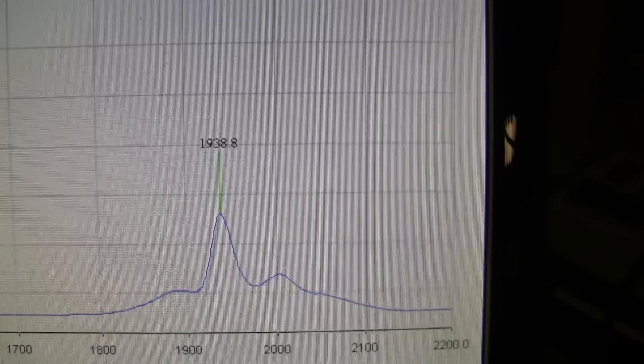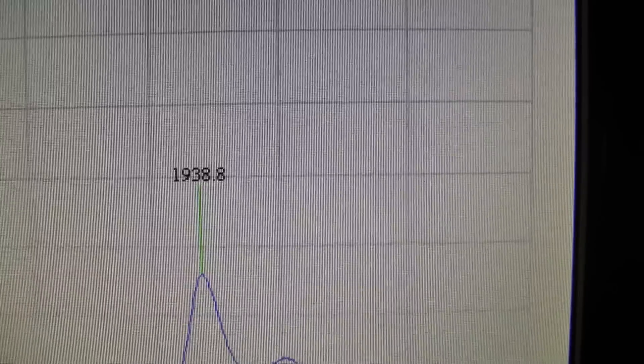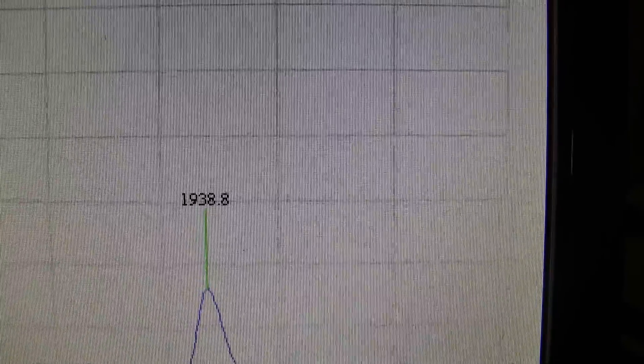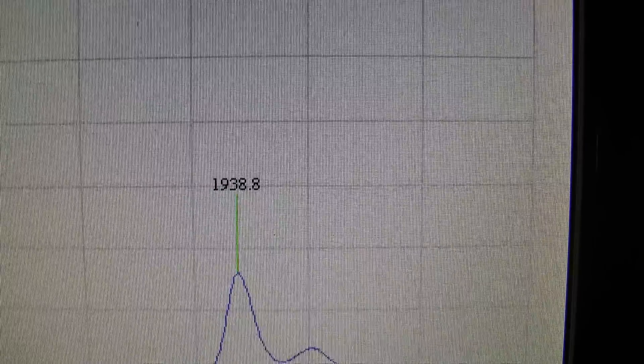And going back to our Near-IR peak. That one is right at 1938.